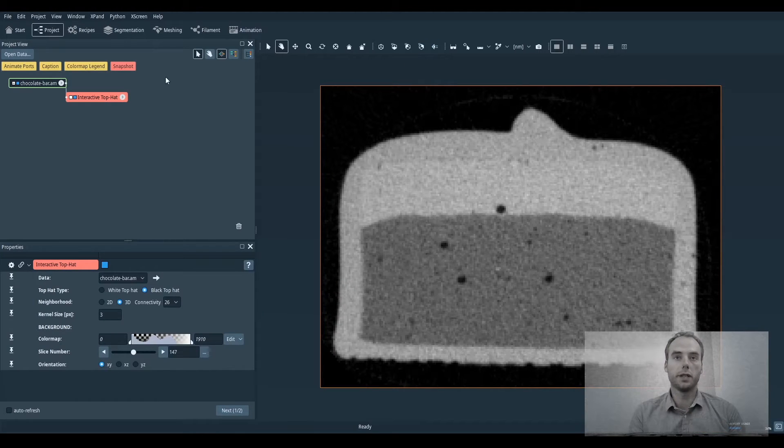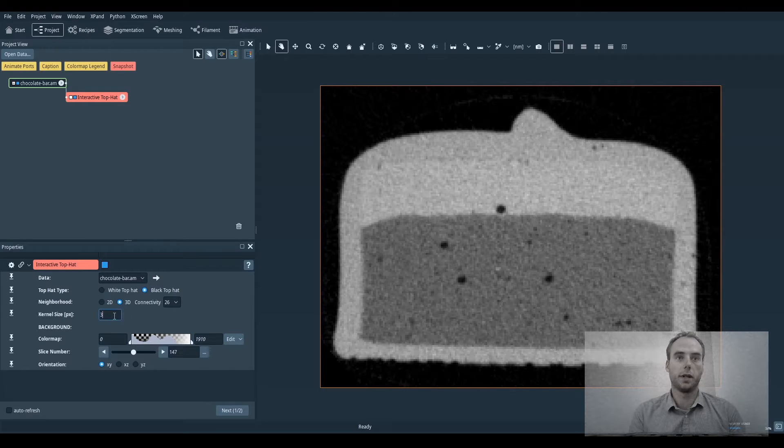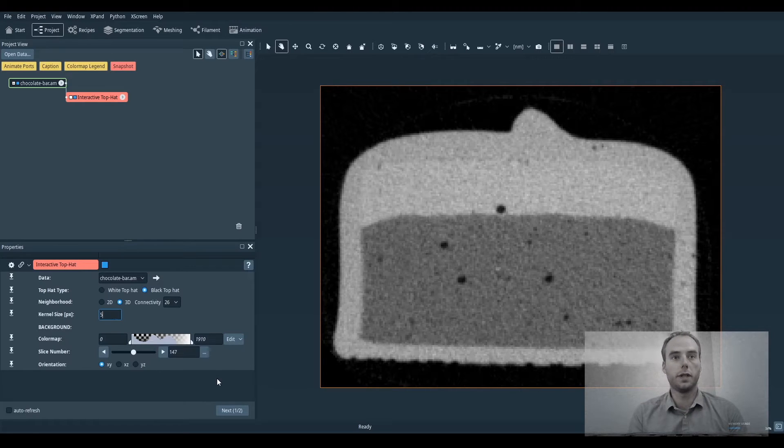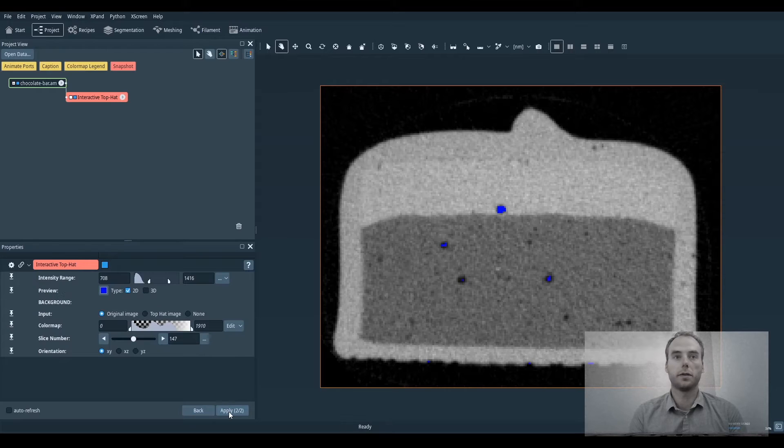So here's a use case of interactive top hat segmentation. First we set the size of the internal porosity we want to segment.